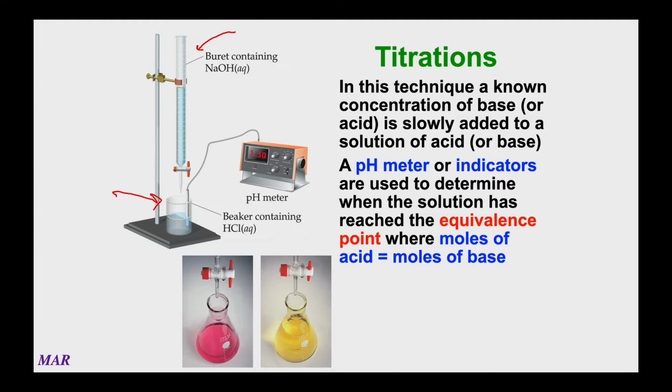And if you know where the equivalence point is, there's a lot of things you can do. A pH meter or a pH probe can be used to analyze the pH at these different amounts. And if you understand what's happening in a titration, the pH meter can be really, really helpful. Sometimes people use an indicator, and if you look in the bottom middle part right there, this is a pink to yellow transition. An indicator, if chosen correctly, can be really helpful. It's a visual cue to tell you when you've gotten to this equivalence point. And from the equivalence point, there's lots of information you can find. If you don't know what kind of acid you have, or you don't know the concentration, or the base for that matter, you can do it.